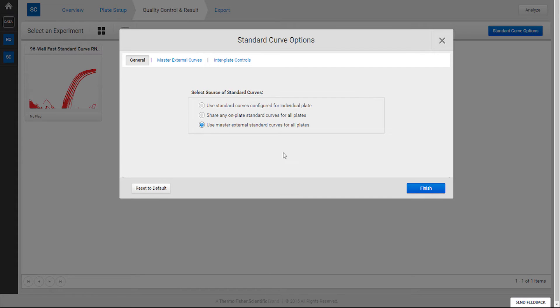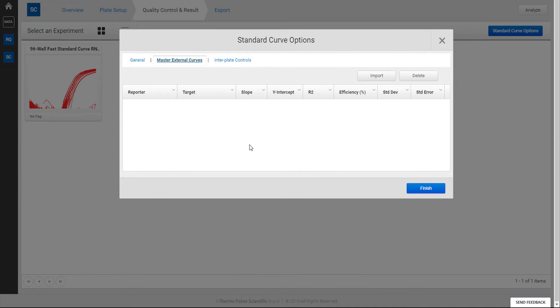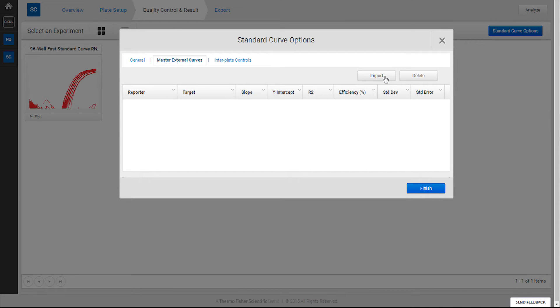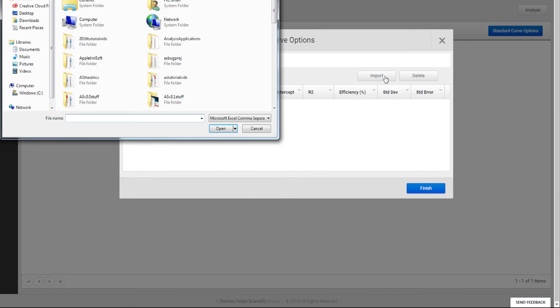This is also called the Master Standard Curve option. If you choose to use the third Master Standard Curve option, you will need to import the Standard Curve into the second Master External Curve sub-tab.